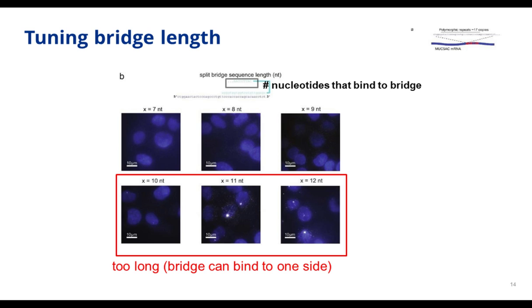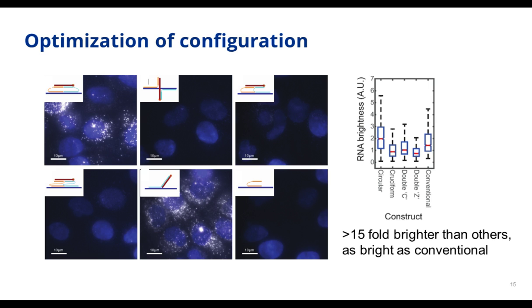And we see that when the nucleotide is longer, it's already able to bind to the fluorescently labeled readout probes, right? But when the length is shorter, it's not able to bind. So we found that we need the length to be 9 nucleotides or shorter for any individual split probe not to bind. And of course, to complete the optimization, we also need to see under what condition, when two probes come together, it can give off fluorescence.